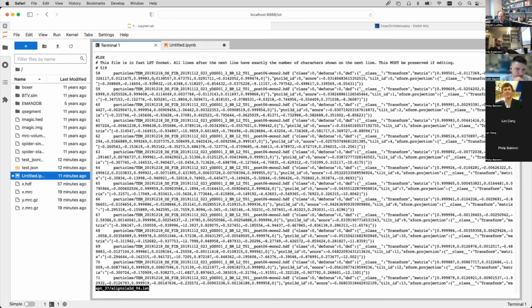We considered for a while just going with star files for this purpose, and we are planning to still support direct reading of star files in EMAN2 in a similar way. But since we lose this mechanism to quickly seek inside the file, we felt that was too big a price to pay. There are also other issues with star files.